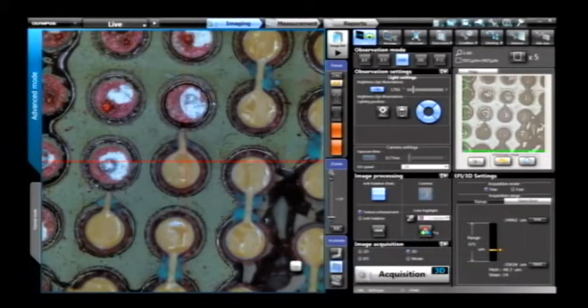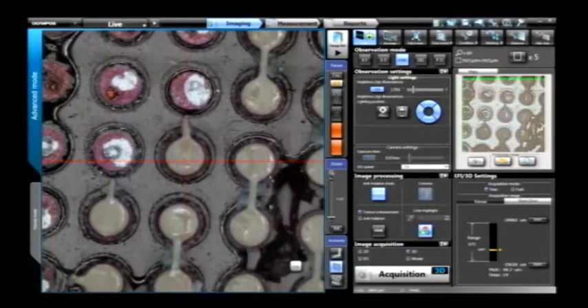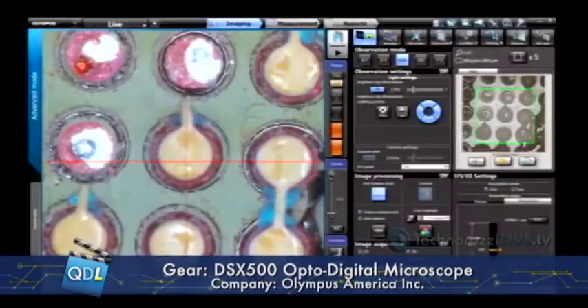We also have a Color Highlighting feature that lets you select a color range with a dropper tool — for example, selecting a red range — and when you activate it, everything else turns black and white or grayscale. So all the blue colors go grayscale except for the red, meaning as you scan around your sample, the red really sticks out. This is another way to highlight particular types of features or color defects on your surface. If you're looking for a specific color, you can set focus on just that color and it pops right out as you move around.